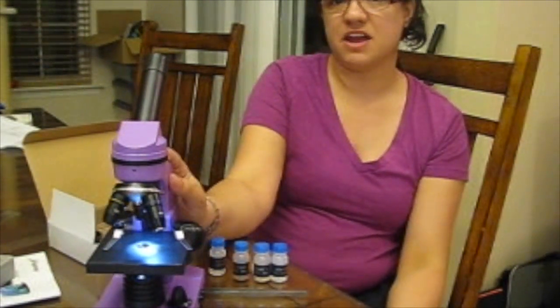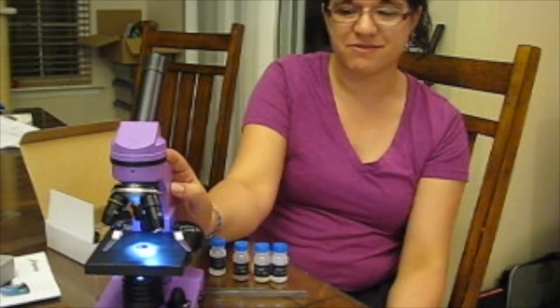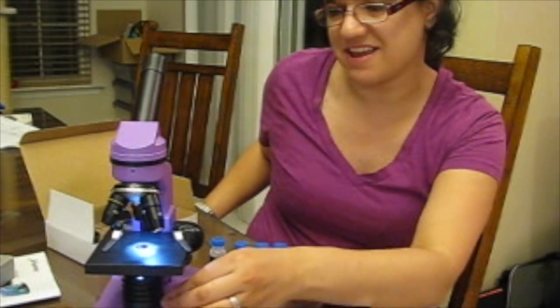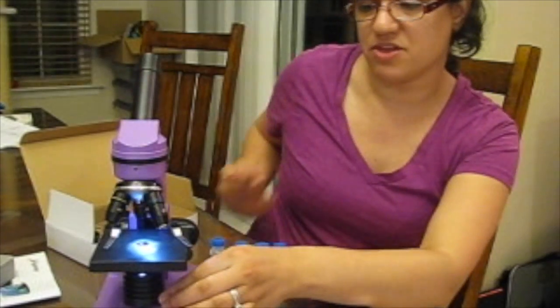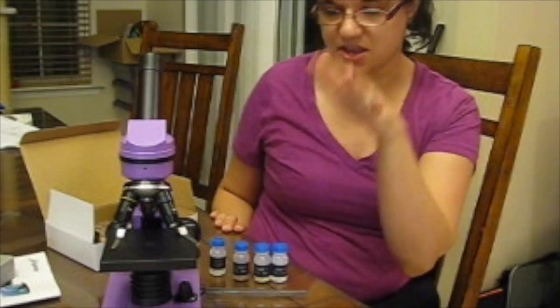So all in all, I'm really pleased with this as kind of a beginner home microscope. Having both the upper and lower light sources is a really nice touch. You can really get as good of a view as possible.